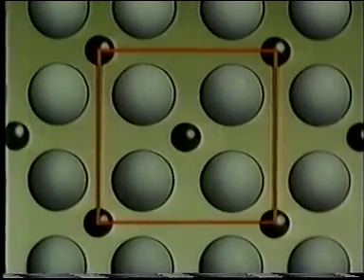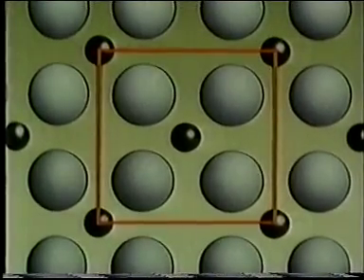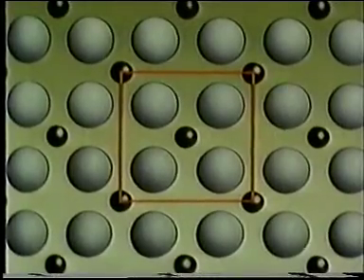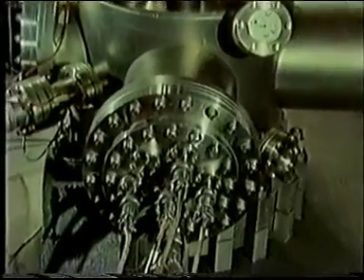Now, how many nitrogen atoms does the surface nitrogen unit cell contain? 1 and 4/4, 2. And there are also 4 iron atoms within the bounds of the cell. So on the saturated surface, there will be 2 nitrogen atoms to every 4 iron atoms, a ratio of 1 to 2. To complete the calibration, we simply turn the sample to face the electron beam of the Auger spectrometer.